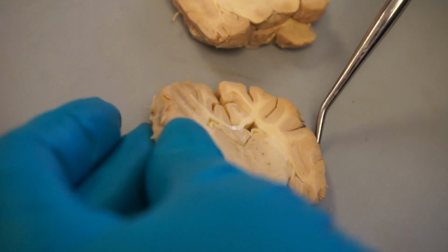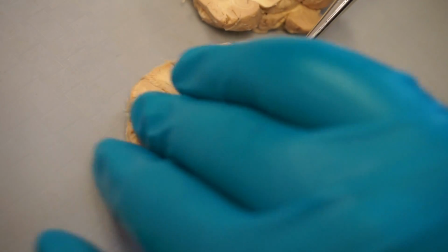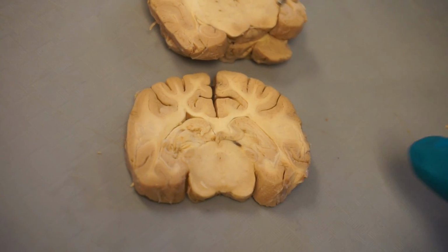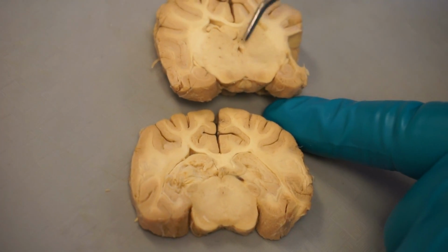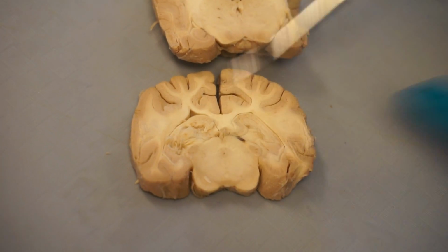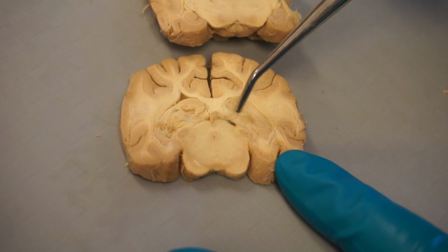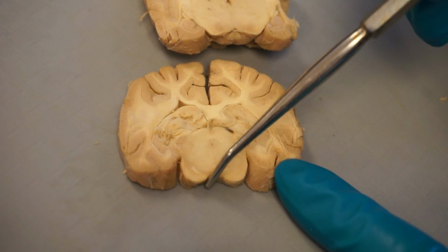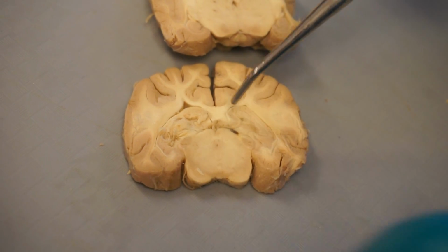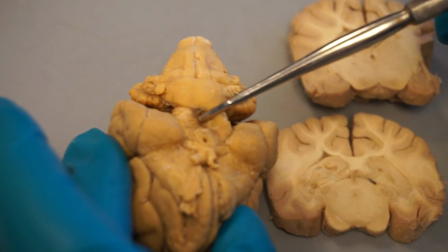I'm going to flip it over on the other side and watch what happens. Now we went from this butterfly look to what I call the Mickey Mouse appearance. We still have crus cerebri on the bottom. Those are the little butt cheeks that look like this.